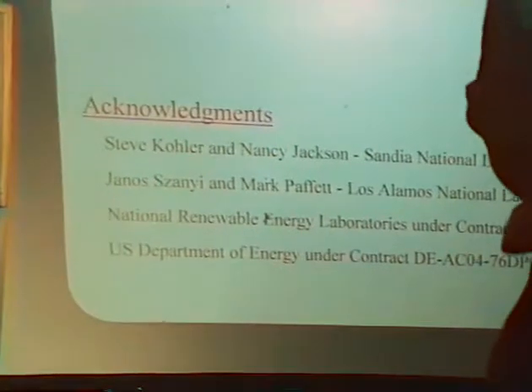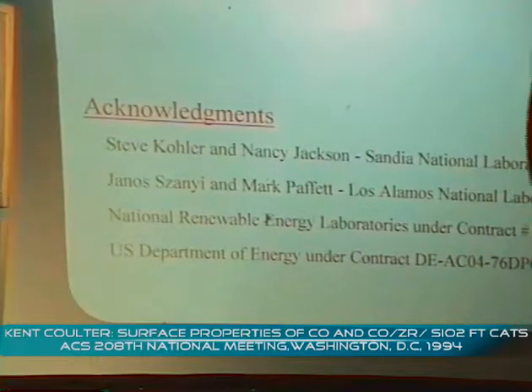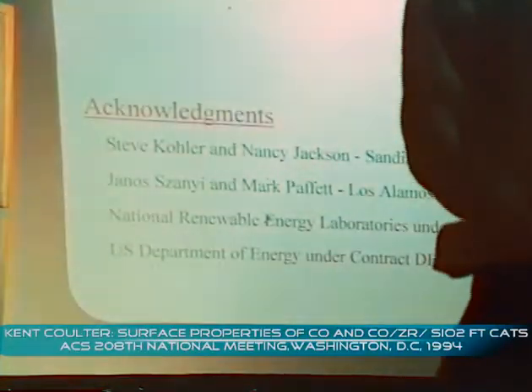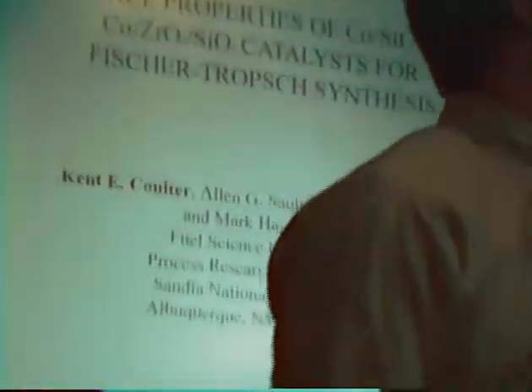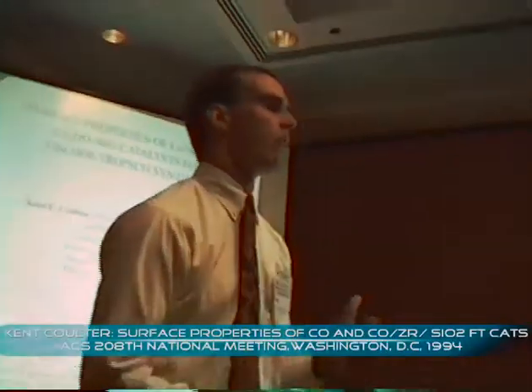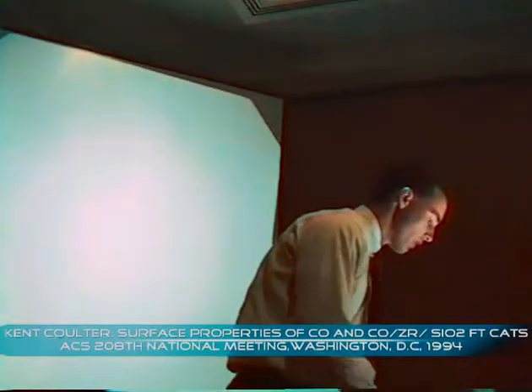In my presentation today, just about the only thing that's going to resemble the abstract that I submitted approximately 4 months ago is the title of the talk. At that time, we had very high hopes of using infrared analysis of CO adsorption on these cobalt on silica catalysts and the zirconia promoted catalysts as an analysis tool for identifying active sites, for identifying surface morphology, and also for looking at the promotion of zirconia on cobalt. Since that time, we've run into some unfortunate problems.